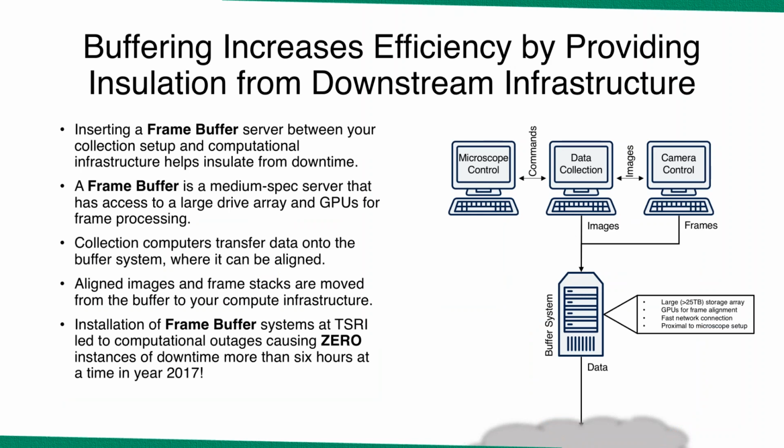And some of the companies that make these hardware, like Gatan and FEI, are starting to implement things like this. But essentially, a buffer system is just a medium spec server, a frame buffer that sits between your facility and your centralized compute.